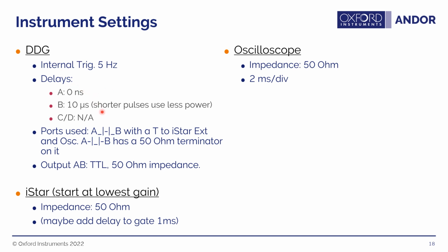I've added some delays. In this particular delay generator that I'm showing photographs of, I have to set channel A and B so that I can use channel AB with a little hat there. Setting A and B sets the width of that pulse. The other delay generators may vary, so you may have to make some of your own adjustments. And in this case, it needed a 50 ohm terminator on the opposite upside down hat. And I set that to a 50 ohm impedance pulse.